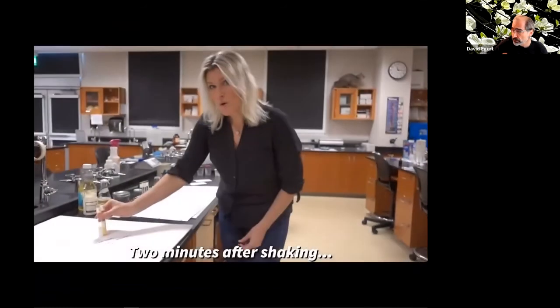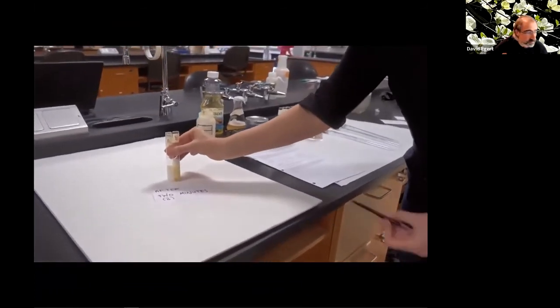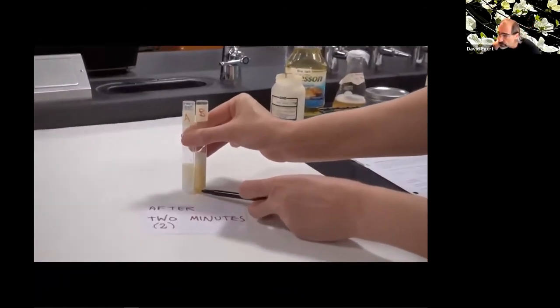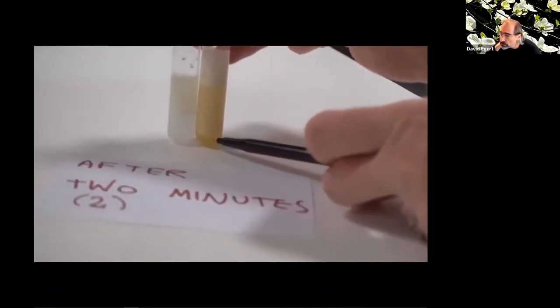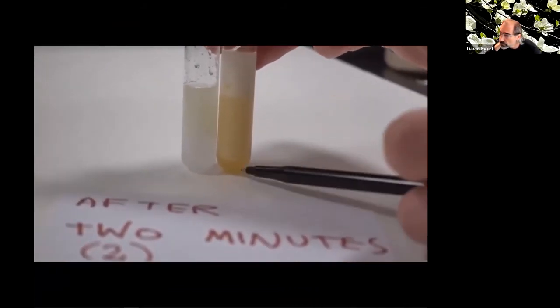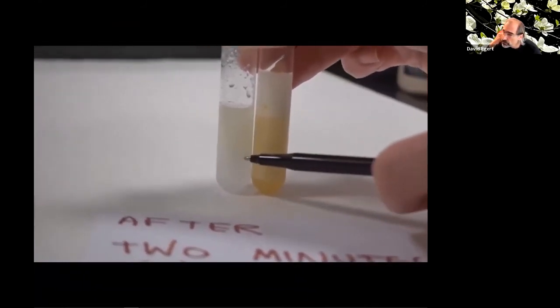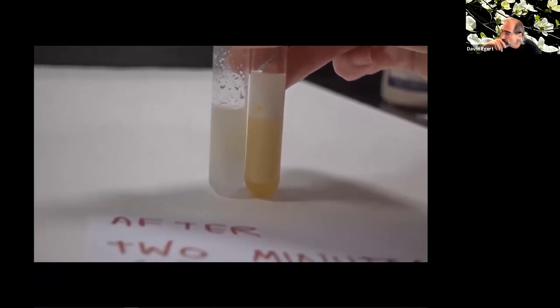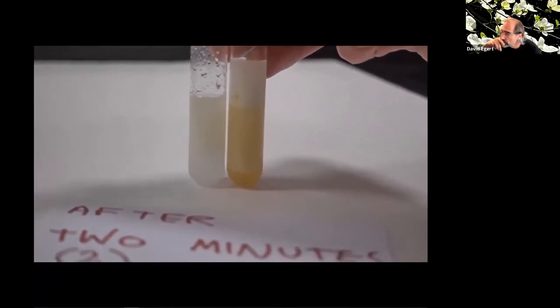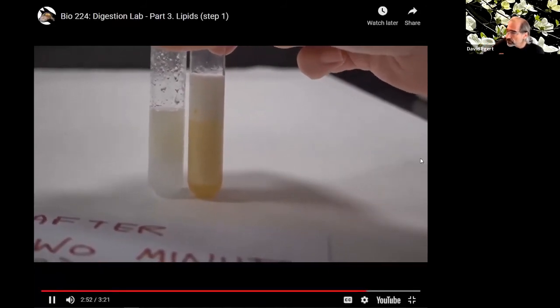All right, so we're going to take a look at our test tubes now after 2 minutes. You can see at the bottom of test tube B, we have a little water down here. It's colored a little brown, yellowish, because there are bile salts also in this water. And you can see that in test tube A, we have the water layer and the oil layer coming back. So we'll wait another minute and take a look at what happens.